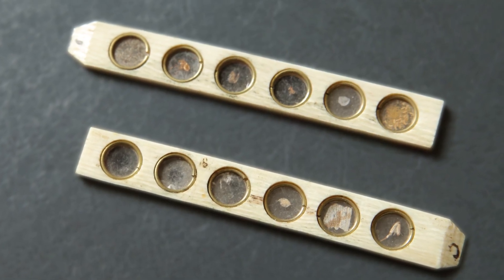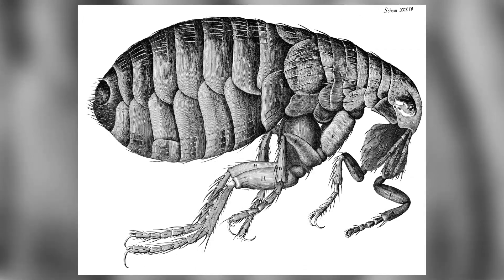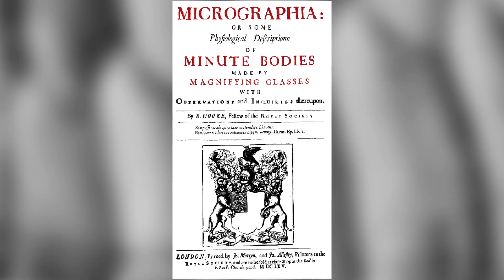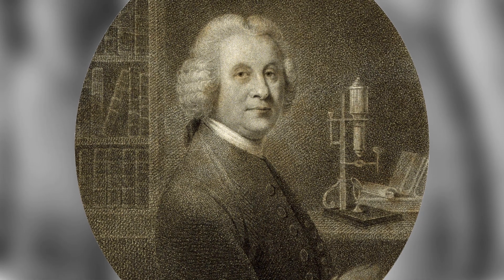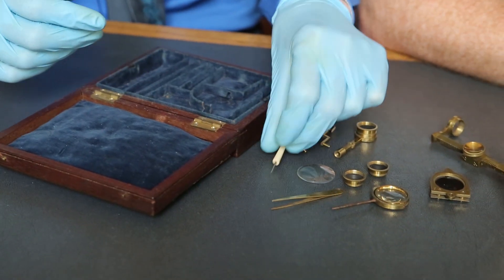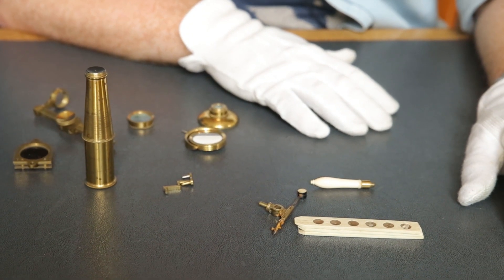These are like little slides and I can see it looks like the wings of insects and things like that. When you bought a microscope in the 18th or early 19th century, quite often you would get made-up slides of classic images like the flea, which of course is a Hooke micrograph, and they were just to get you started. This one's provenance is quite interesting because it allegedly belonged to Henry Baker, who's one of the great microscopists of the 18th century. It seems a little bit late for Baker, but that's what we're told in the provenance records. So you think maybe they're saying this microscope belonged to a bit of a microscope hero just to make it sound better? He wrote several classic 18th century books on the microscope.